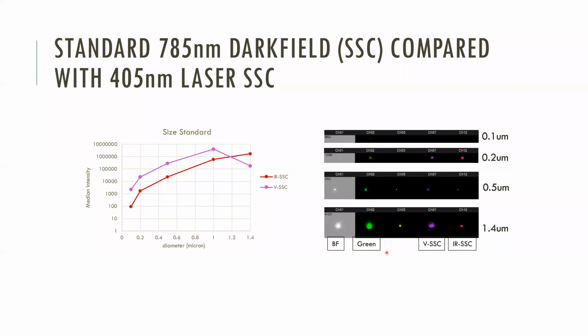Were there any other questions? We did have one on the quantification of the EV subpopulation with the ImageStream as compared to nano FCM, although I think you may have covered it somewhat. Yeah, nano FCM is a slightly modified version of a flow cytometer that's purpose built to be used for microparticle research. For us in the core, we haven't evaluated that very carefully. In a core lab, you really need to make a decision about instrumentation that can be used for a lot of different applications, whereas a lab that strictly did EV research maybe would want to make an expensive investment in a really single purpose instrument. So I can't tell you too much about the direct comparison there. Those nano FCM instruments do look like they're pretty good though.